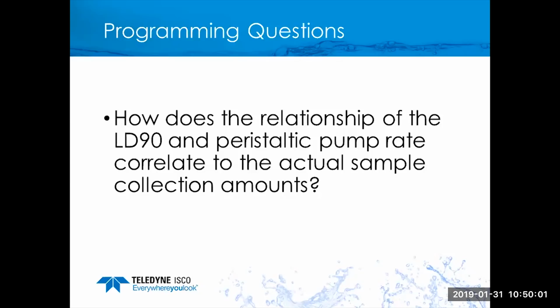Okay, there's another question here related to programming. When I change a parameter on a program, it is not saved for the next. How can I save the change? That question really, at this point in time, is not specific enough or detailed enough for me to be able to provide a direct answer to it, but I can answer in general.